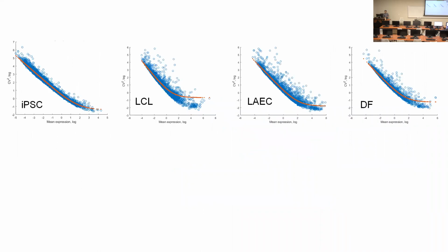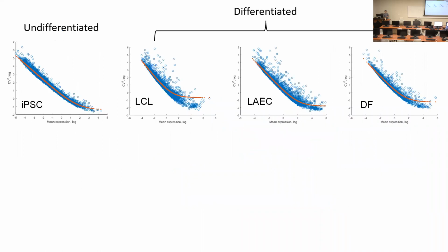No enrichment terms. Because they haven't been differentiated into any specific cells, they are not registered to any particular function. So you don't need any gene or set of genes to be expressed highly noisily in order to achieve any goals, because they are not yet ready to be functional in any direction.